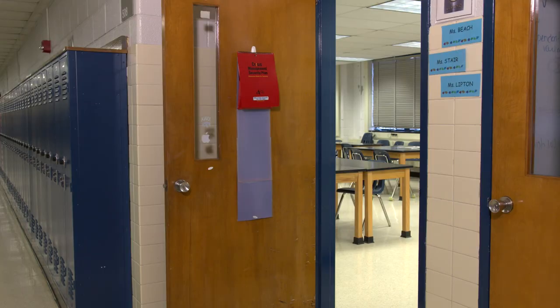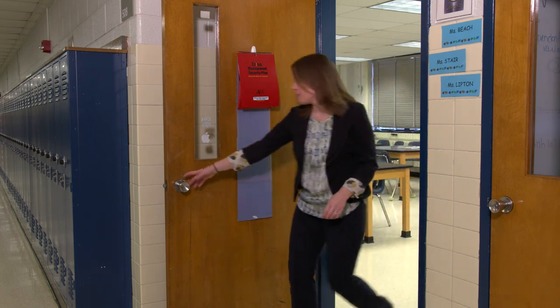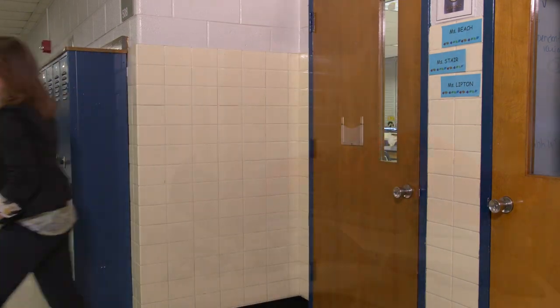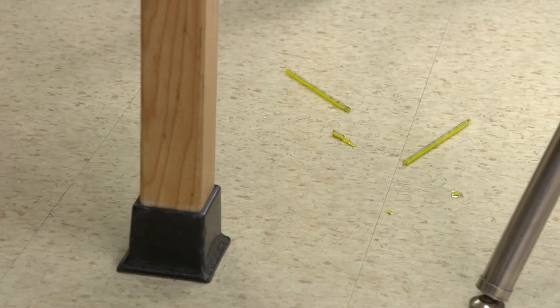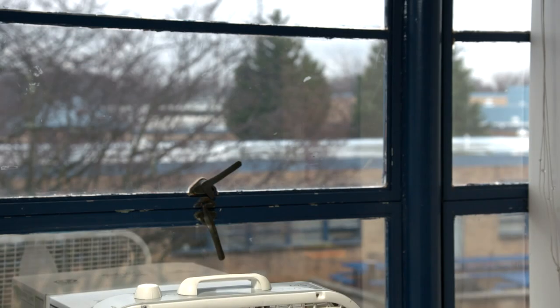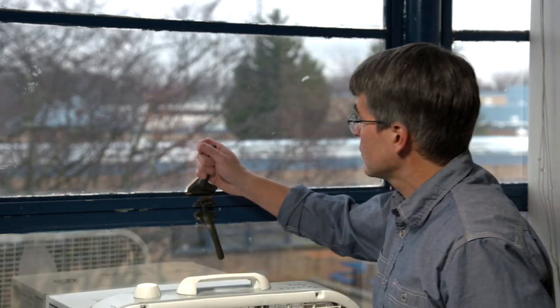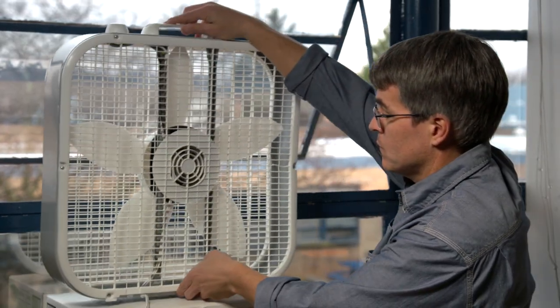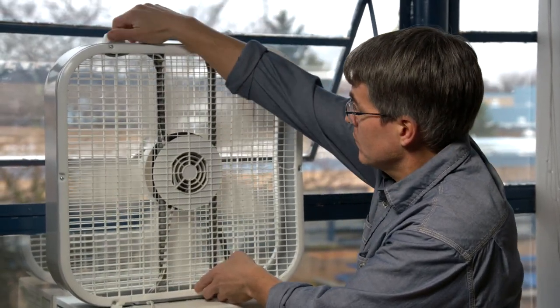Next, isolate or close off the room to minimize the spread of mercury vapors in the school. This action will include shutting air vents and closing doors and turning off the central air system to stop air circulation into and out of the spill area. Ventilate or air out the spill area as much as possible. Open windows and position fans to blow mercury vapors out of the building. Finally, never use a vacuum or broom to try to clean up the mercury. This breaks up mercury into small beads and will worsen the spread of the mercury.